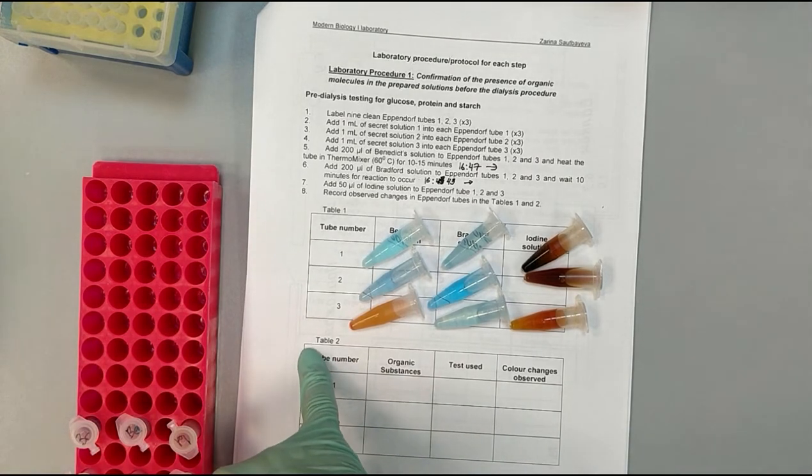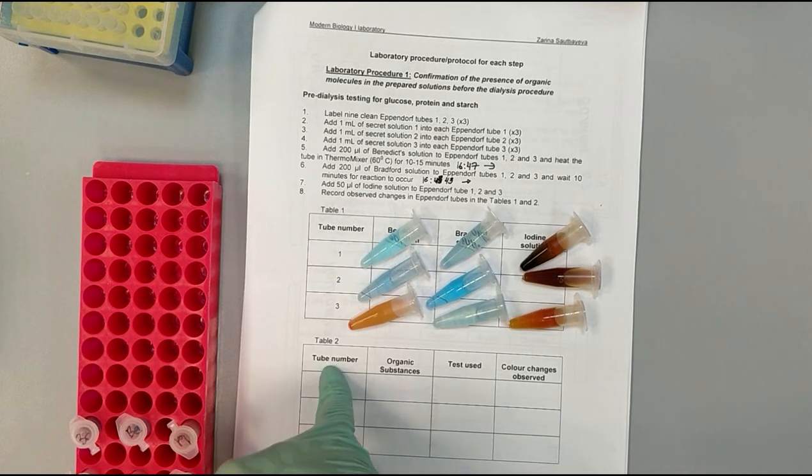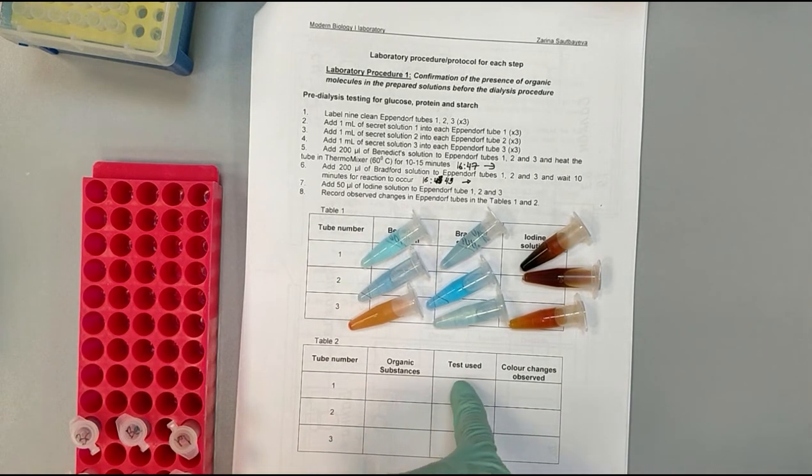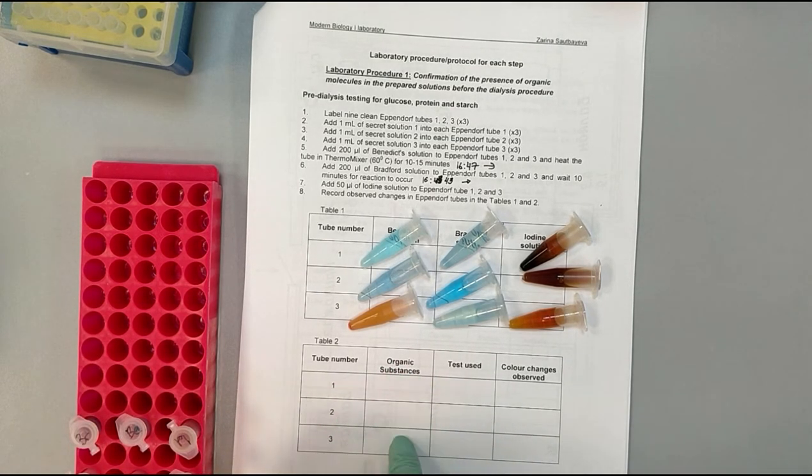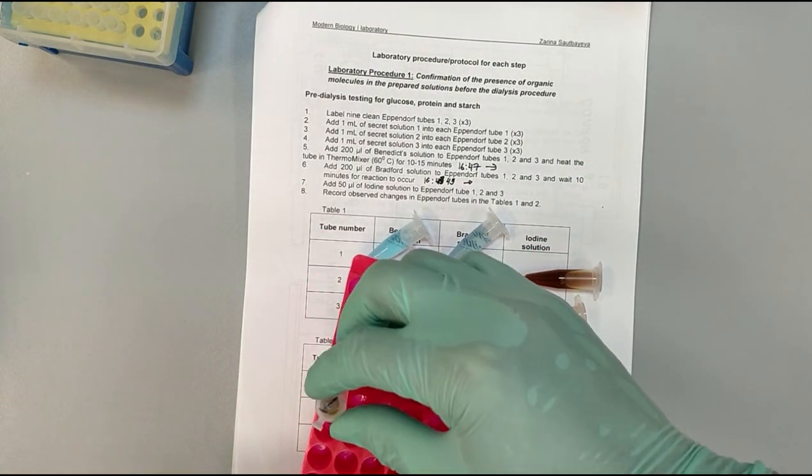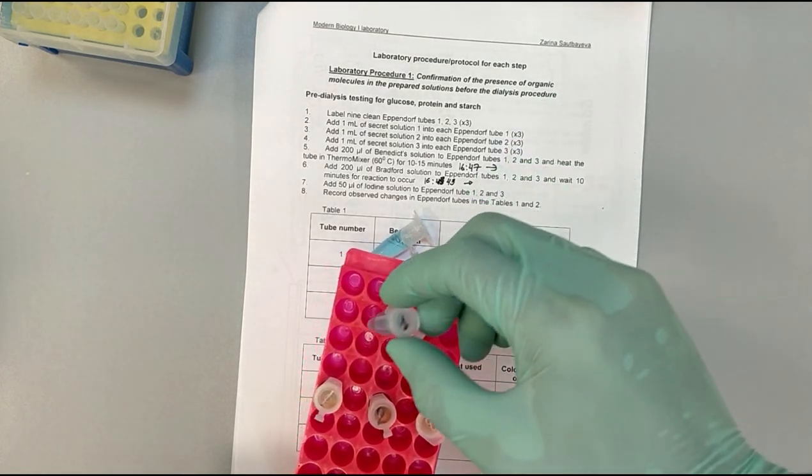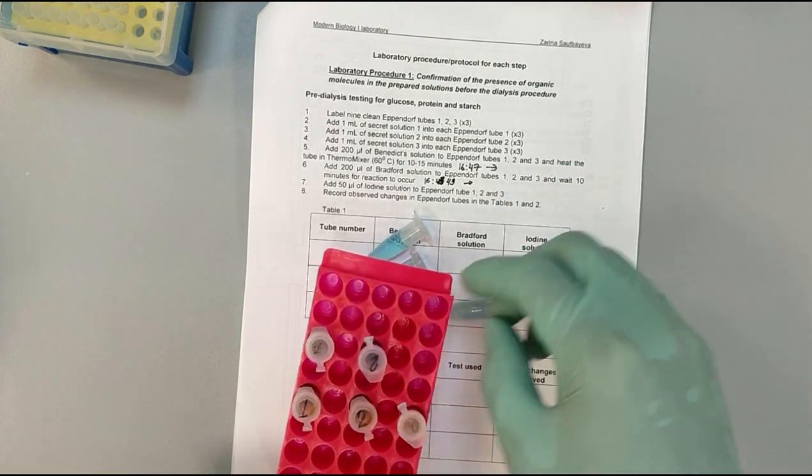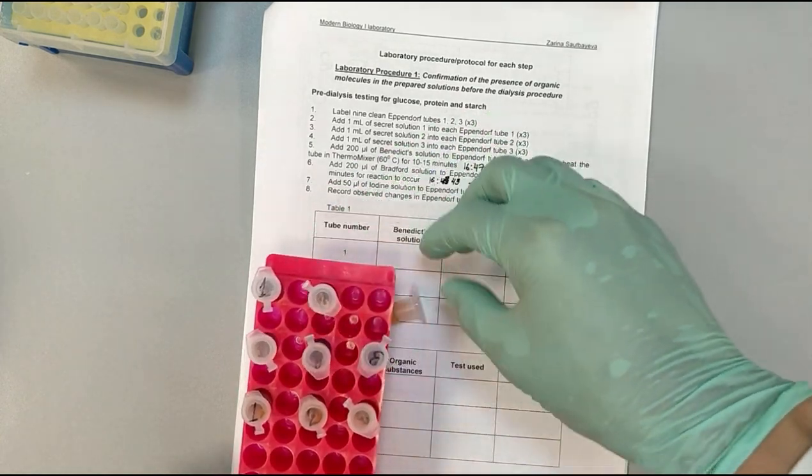In table 2, you are going to write what reaction happened in which of the tubes. You are going to say which test is used, what is the color change, so the reaction, and guess is the organic substance in each of these tubes. You are going to write what reaction happens.